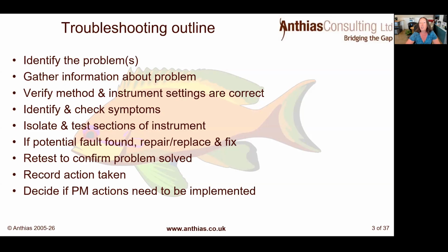Then you want to identify and check your symptoms. So yes, there's a real problem. Yes, it's not because it's been analysed in the wrong way. So there is a problem with the instrumentation. So let's just verify, first of all, what our symptoms are, what the problems are, and the symptoms of that. And again, remember, don't get blinkered into one place. Look at all those different symptoms to start with. So we want to have a really big, thorough picture.